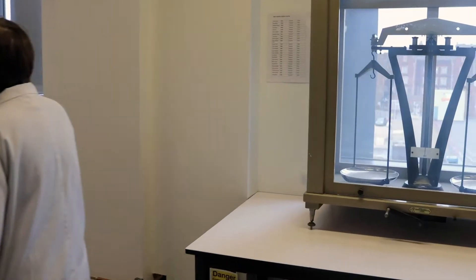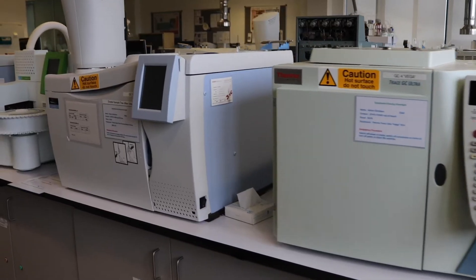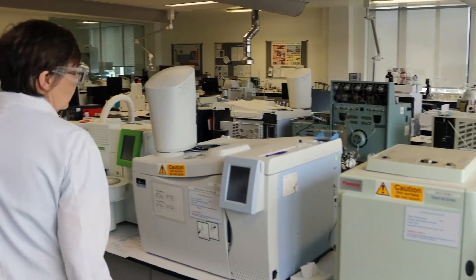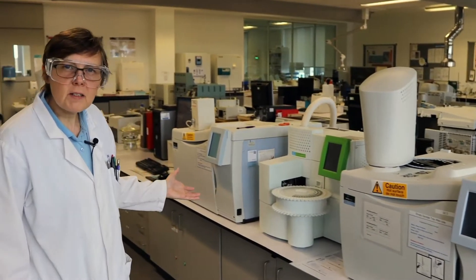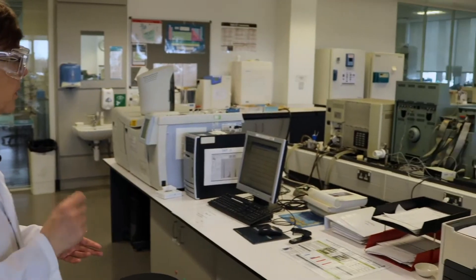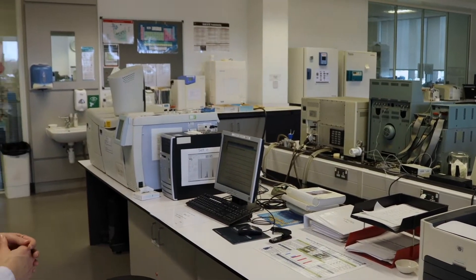Around here we've got our gas chromatographs on this bench. We use this for blood alcohol analysis practicals. These instruments are also used for fire accelerant practicals, and down here we have a gas chromatograph with a mass spectrometer, which is a particularly good instrument for all sorts of analysis — we'll come and have a look at this again in a minute.